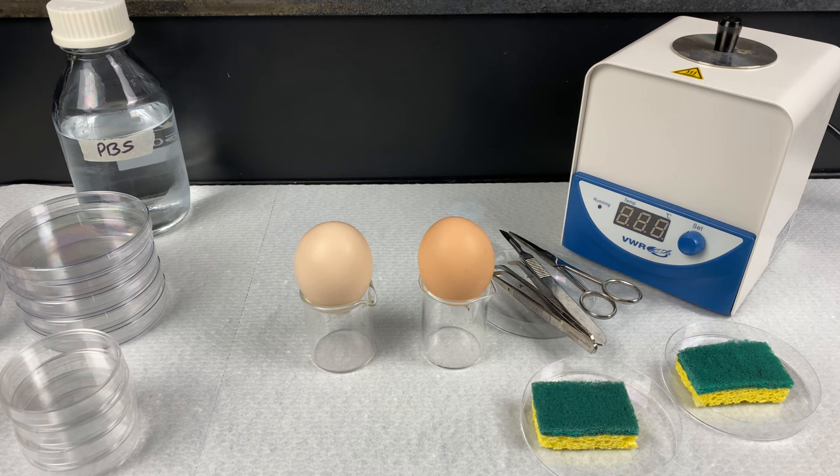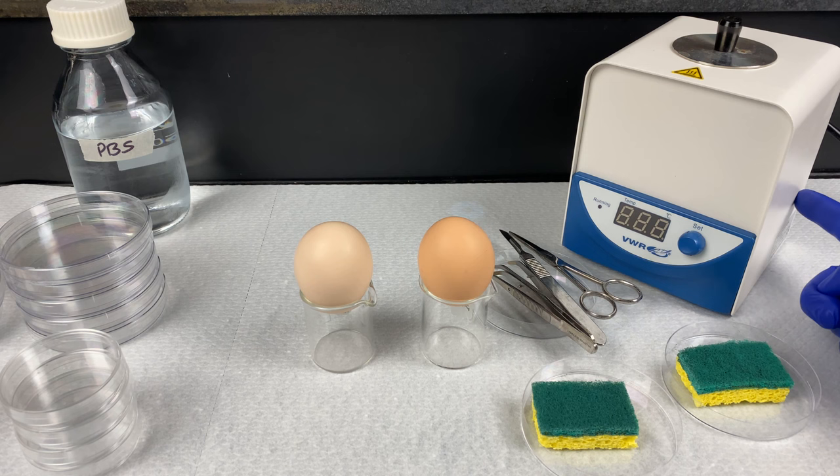Here I have a setup outside a laminar flow hood. If I was actually trying to make cell lines, I would have this occurring in a sterilized biosafety cabinet or laminar flow hood. I have two eggs here — one is fertilized, one is not.